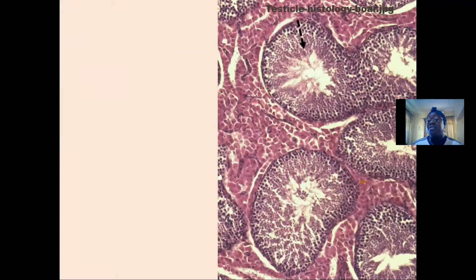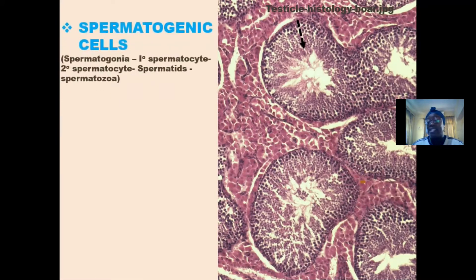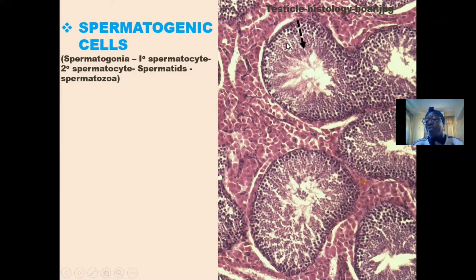Within the seminiferous tubules, we see different types of cells — the spermatogenic cell and the Sertoli cell. The spermatogenic cells are lined around the border of the seminiferous tubules and are seen in layers. This tends to give a form of stratification to the wall of the seminiferous tubules, and that is why we see it in the form of a stratified presentation, whereby the sperm cell is seen at different stages of maturation.